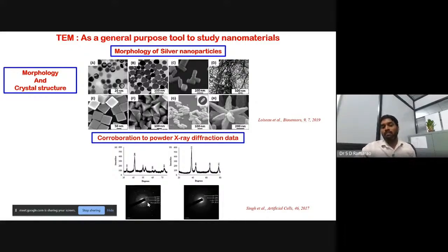You might have studied the famous experiment proving the wave nature of matter, the Davisson and Germer experiment. Similar thing: an electron beam will behave like a wave, and will show diffraction from the crystals. Each diffraction ring is coming from a set of reflections. We call that one a plane.